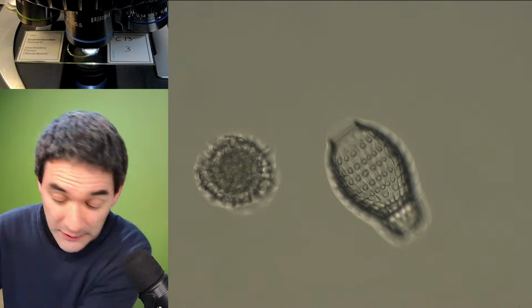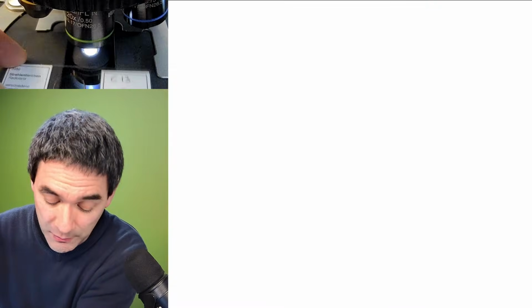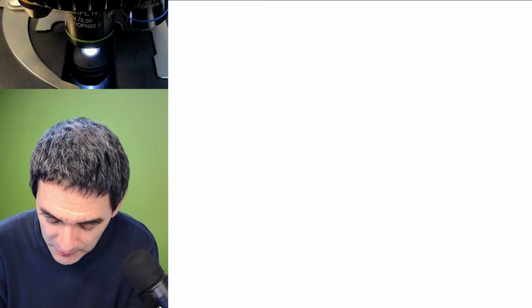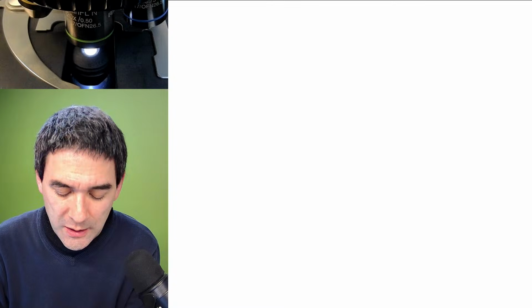So let's move on. I'm just on slide number 3, but I've still got so many left that I want to show you, and also some of you want to see a couple of animal tissues. This one here, that's actually okay. That's actually an interesting one.